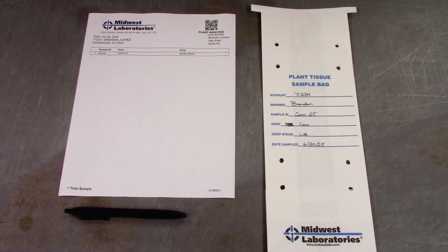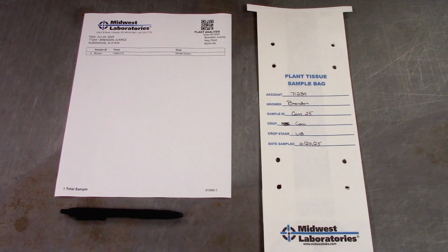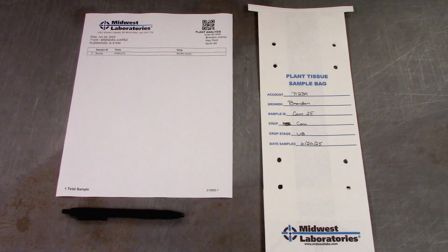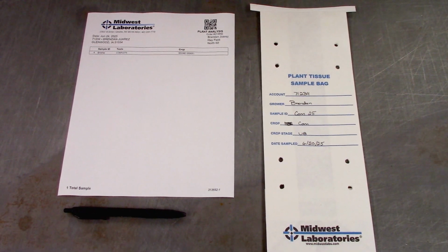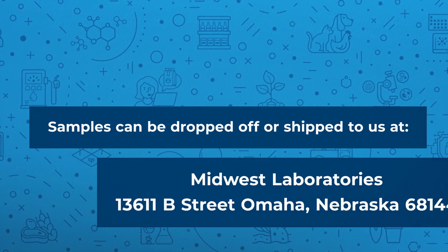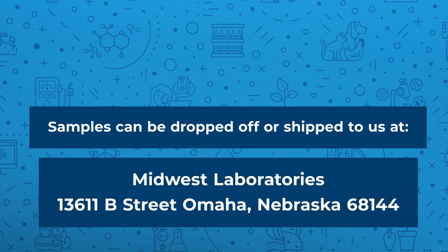And then you'll have that to place in the box with your plant tissue samples, just like you would the printed submittal form. So then you'll place the submittal form and your plant tissue samples in the box, and then you can drop your samples off or ship to Midwest Labs at 13611 B Street, Omaha, Nebraska 68144.